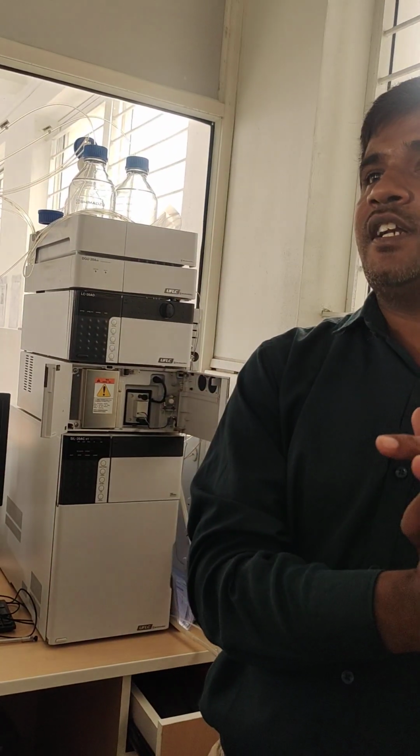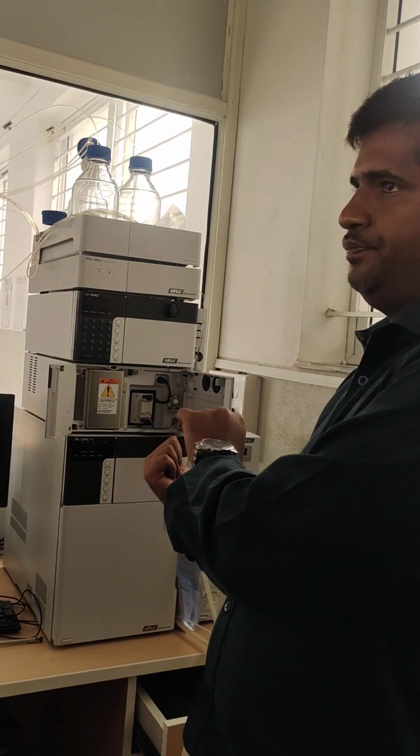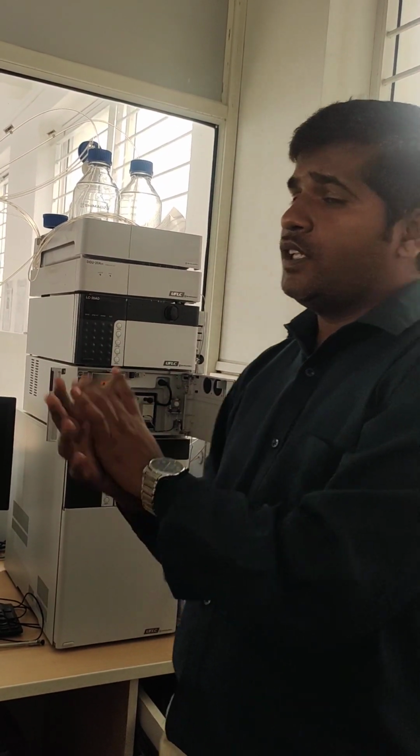An example of a solvent property detector is the refractive index, RI detector. What is the name? RI detector. And the solute property detector is the UV detector. What is that? UV detector. We have this UV detector here. The same UV detector is loaded here. Then the UV detector again has two types. One is the single wavelength detector, another is the multiple wavelength detector. Single wavelength detector means we run the sample at a single wavelength. That is a single wavelength detector.